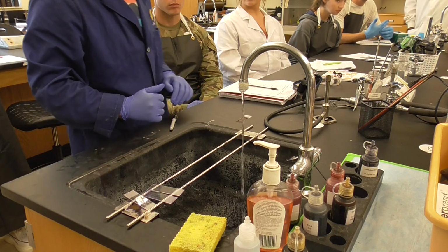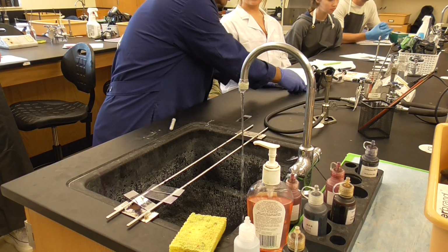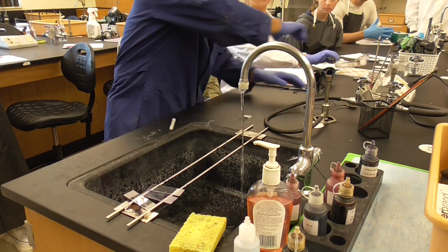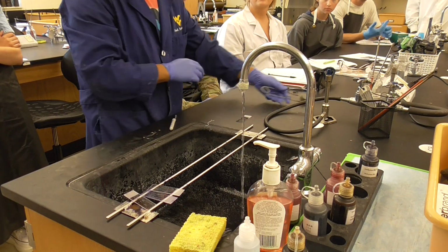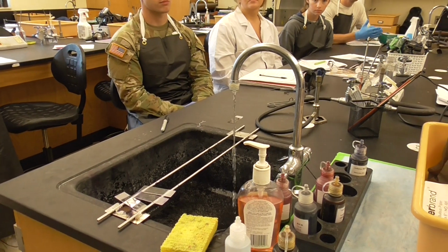Okay. Now the next thing, we're going to have to turn on the Bunsen burner. Make sure you have a little bit of space in front of you. Turn on the Bunsen burner, turn on the gas. The Bunsen burner is on. Okay. So I need to make sure this is covered.